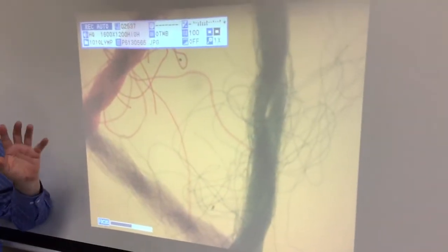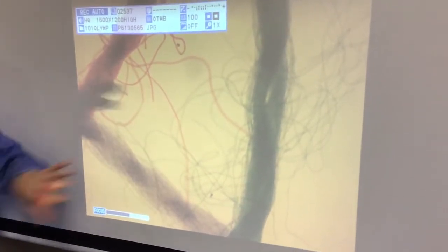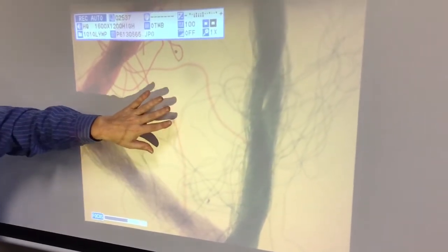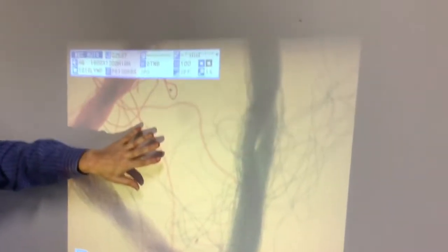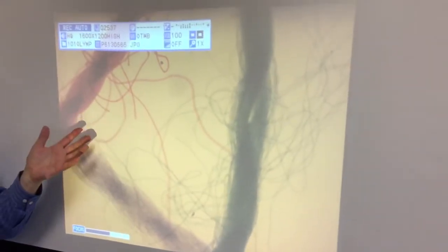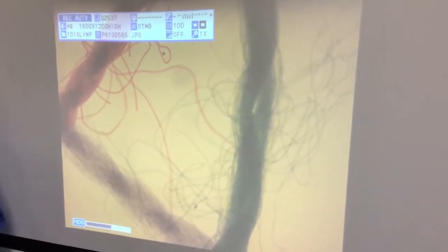Now, there's something about this projector. What I'm looking at has a very white background, and you want a white background with a microscope. If this was what I was seeing through the microscope, I'd brighten my light up. But something about the way this projects makes the background yellow. That's not what you want when you look through a microscope, but you can see the 3 threads.